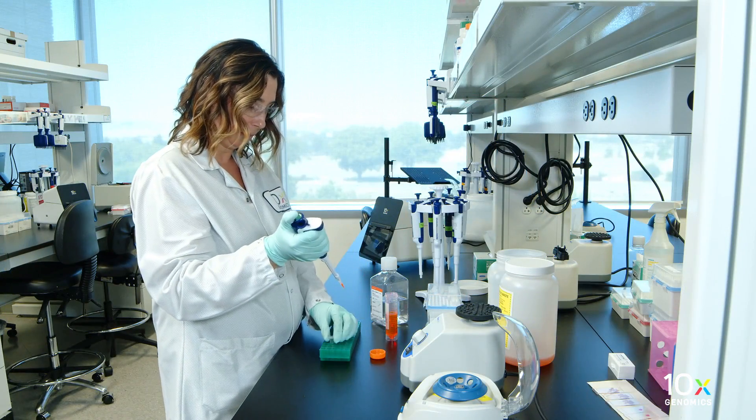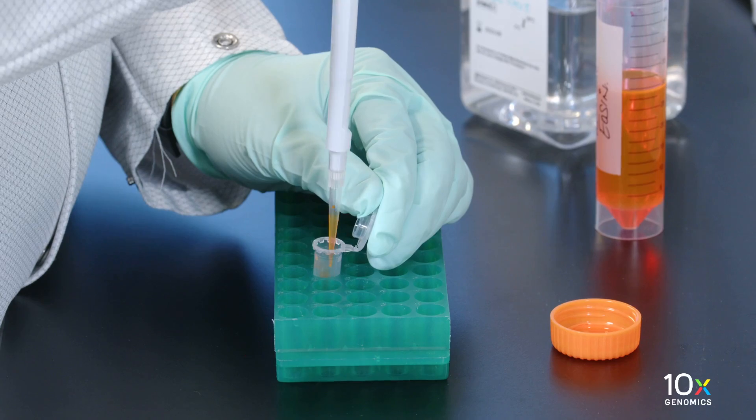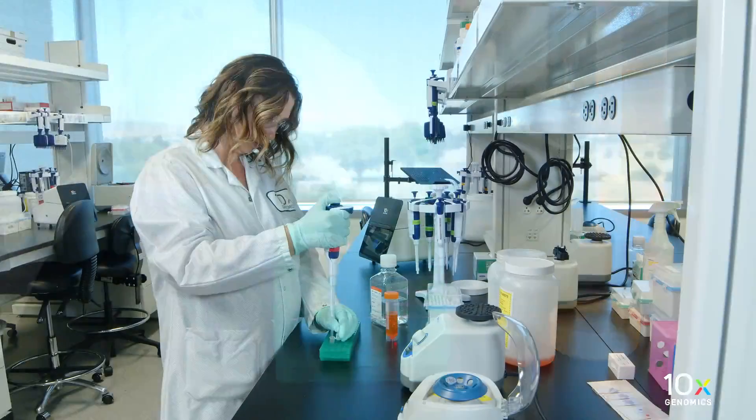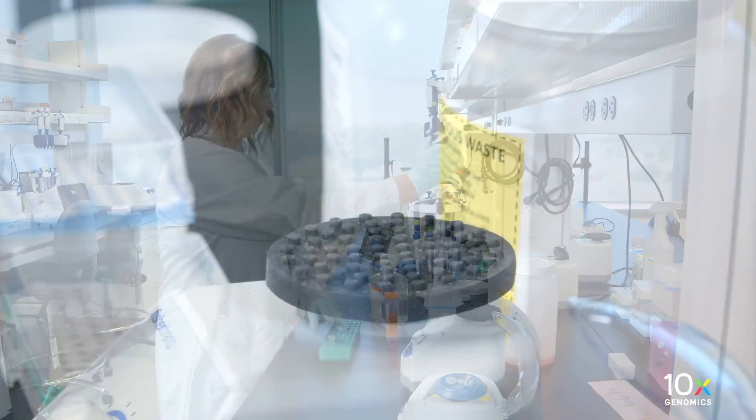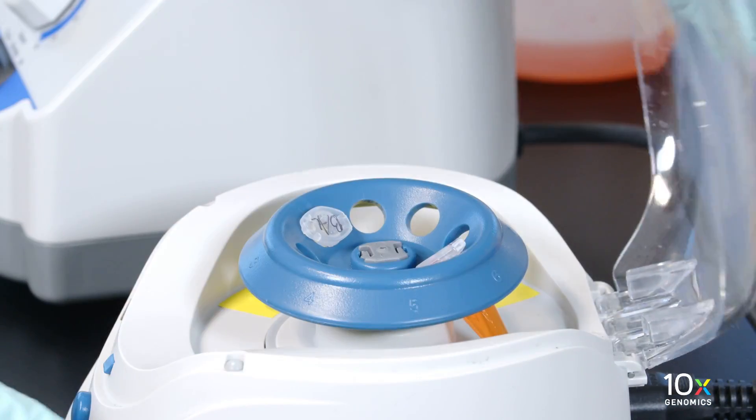Prepare 10% eosin shortly before use by combining alcoholic eosin and 1x PBS. Vortex and centrifuge briefly.